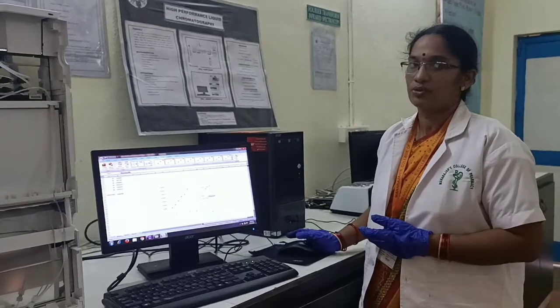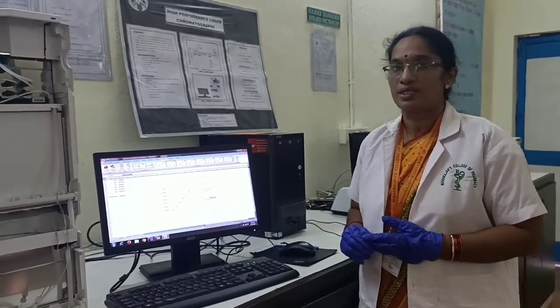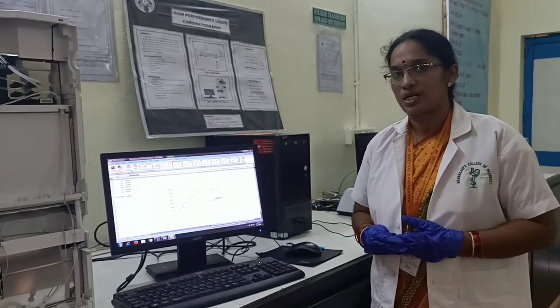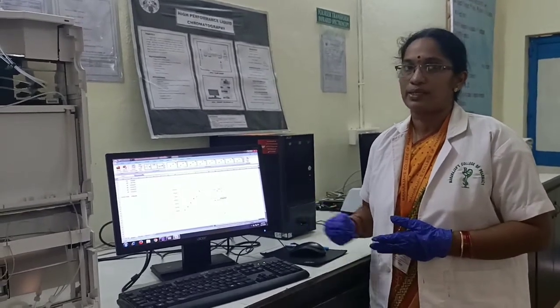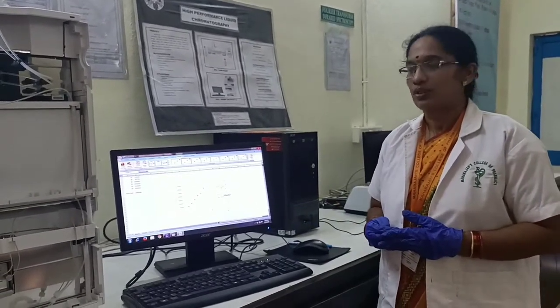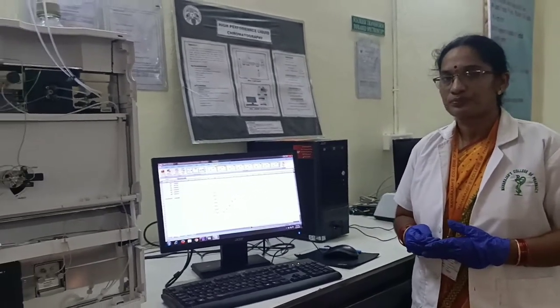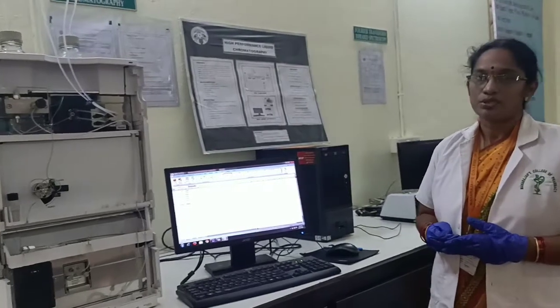So dear students, I hope you have understood how to inject a sample, how to run the chromatogram, how to set the parameters, how to analyze the obtained chromatogram, and how to calculate the amount of the drug that is present in the unknown sample. Hope this video is useful to you.